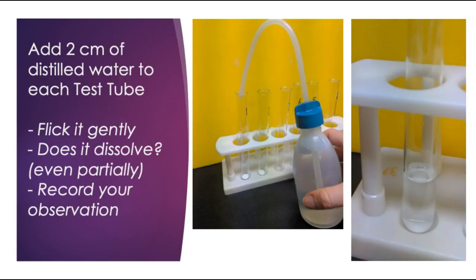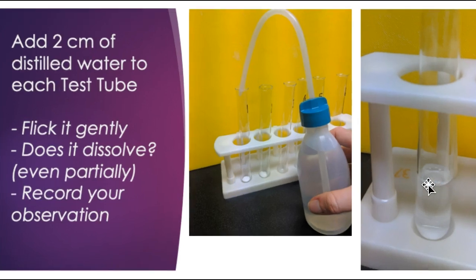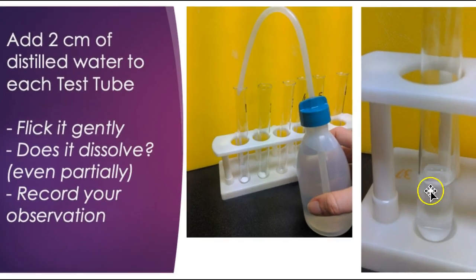After you've done that, you need to see if it's going to dissolve in water. So you need to add about 2 centimeters. Doesn't have to be absolutely perfect, but no more than, say, this level here, to each test tube, and you can pull it out and gently flick it around. Do not put your thumb on top of it and shake it. If you do that, anything that's on your finger will actually contaminate it. Just very gently flick it and see if it dissolves, even partially, and record that down.